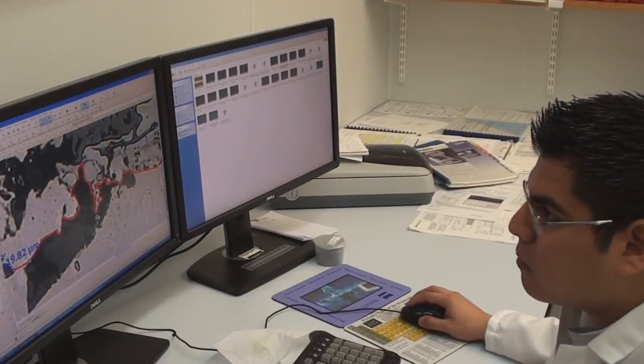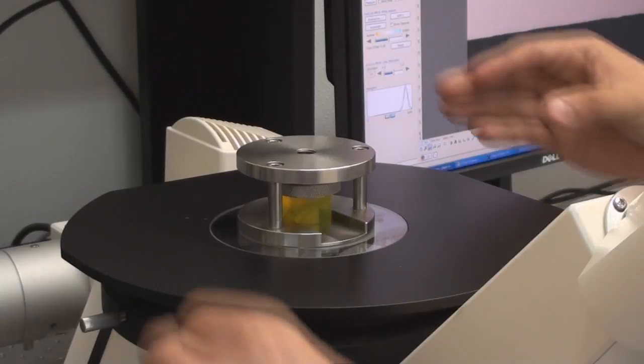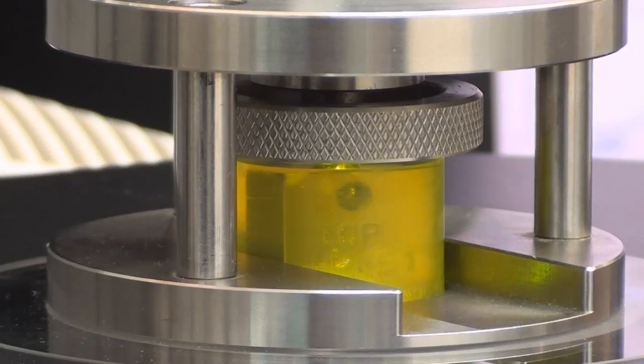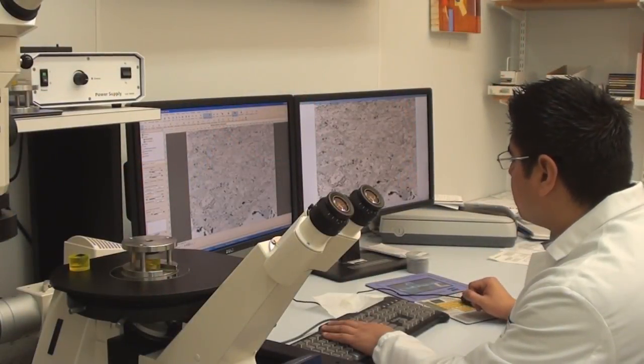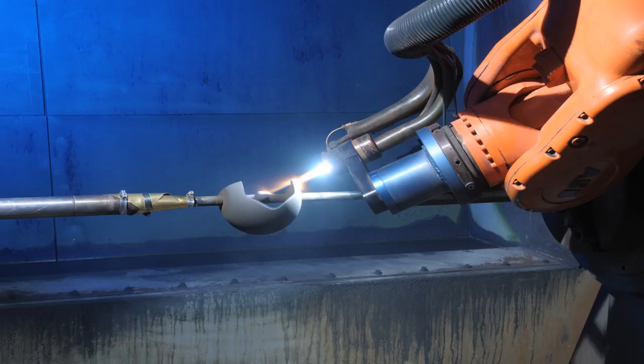Bondline contamination test measures the percentage of grit media embedded into the substrate below an applied thermal spray coating. These contaminants can change surface roughness leading to uncertainty in the coating's bond strength. Less bondline contaminants mean a higher quality final coating. We take a metallographically prepared microstructure and measure the bondline-embedded contaminants using a digital microscope. It's especially important to minimize bondline contaminants in ceramic coatings without a metal bond coat.